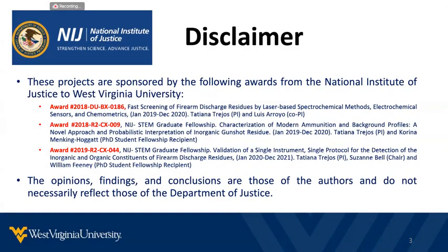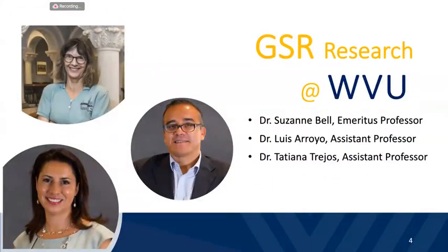Josh already introduced us, so I'm going to just add that Dr. Suzanne Bell, as Josh mentioned, cannot be here with us today, but I'll be presenting on her behalf. I'm going to be presenting and discussing her research on LCMS work. Dr. Luis Arroyo's presentation today will be focused on the electrochemistry application for gunshot residues, and I'll be presenting on the application of laser-induced breakdown spectroscopy, or LIBS.